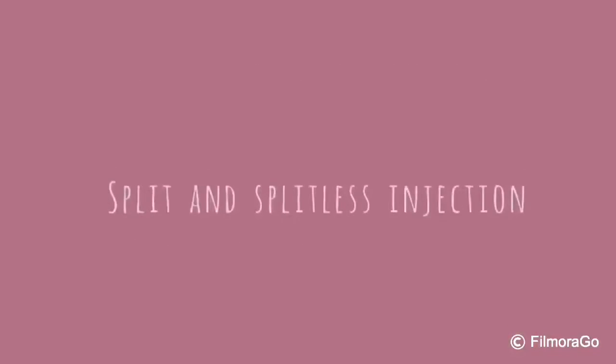Next, I will explain the mobile and stationary phase in gas chromatography. The mobile phase is where the mixture of a gas sample is dissolved in a fluid. The fluid is usually an inert gas such as helium, argon, and nitrogen. The stationary phase is where the mixture of gas from the mobile phase goes through the holding structure. The holding structure is usually a high molecular weight polymer coating the capillary column.